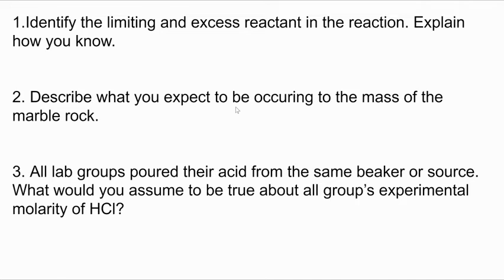Once you do that, you'll answer the post-lab questions. Identify the limiting and excess reactant. Describe what would happen to the mass of the marble rock. And if all lab groups poured their acid from the same beaker or source, what would you assume to be true about the groups' experimental molarity of hydrochloric acid? Pause me for a second, answer these questions, and then we'll talk them through.